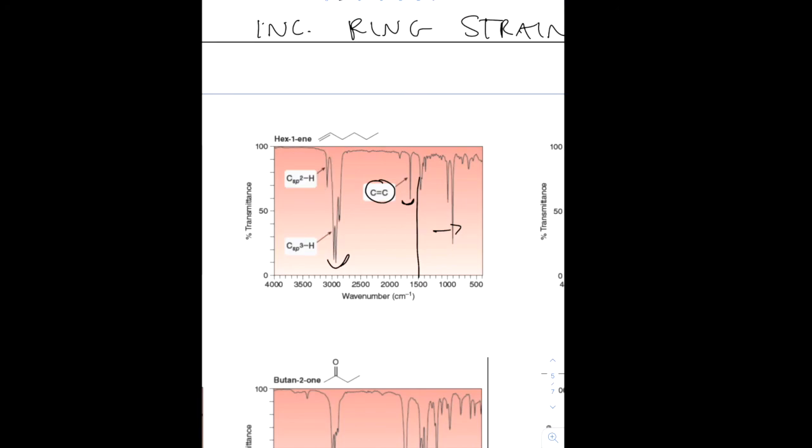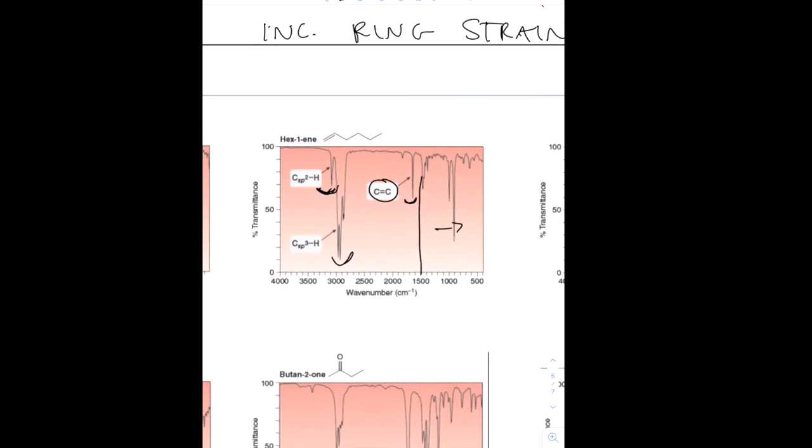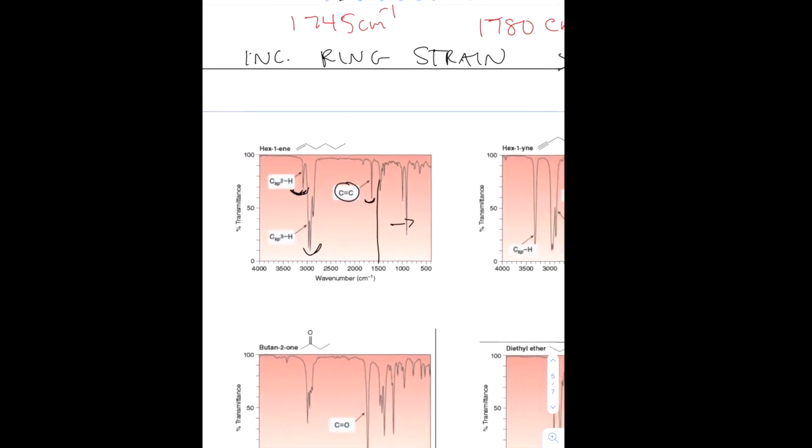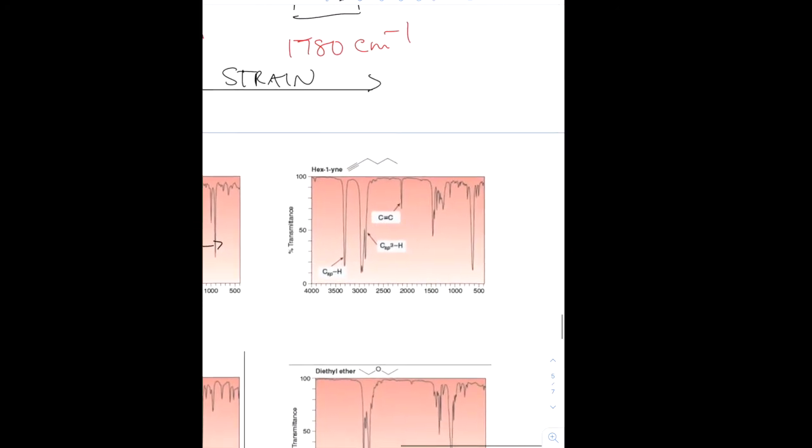I like to think of it like a weird creepy hand sticking down. It's pretty much like the dew claw for a little puppy, right? It's kind of way back there, but it looks like a thumb of a hand, but it's way too far back and weird to be a human maybe. And so that's what the Csp2-H stretch shows up and looks like.